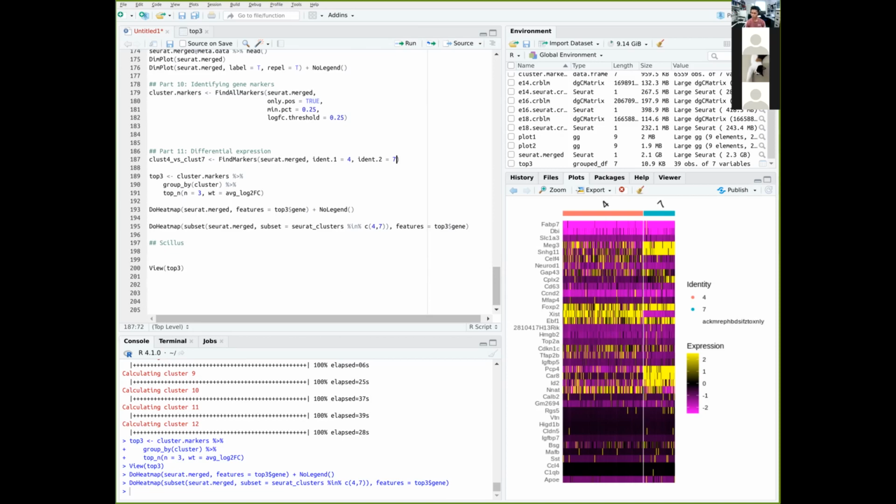There are a couple of things that I want to basically add on, some information for you to sort of bring back. The first is you can actually use the same workflow for single cell ATAC-seq. It does use some sort of same pipeline and same syntax, and it works okay. But there are other tools that you can actually use. I want to mention just two. One is ChromVAR. I pasted it in Etherpad, and the other one is ArchR. These two are currently one of the better tools for single-cell ATAC-seq data. So try to use that.